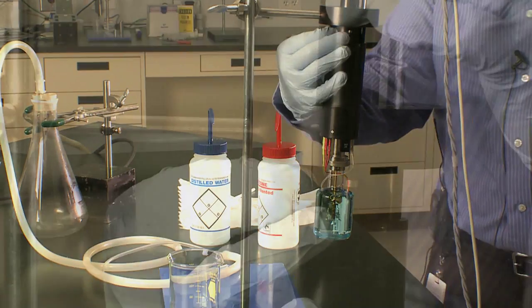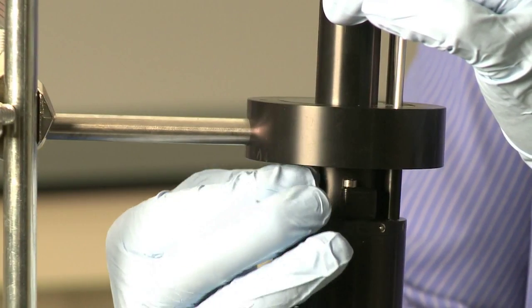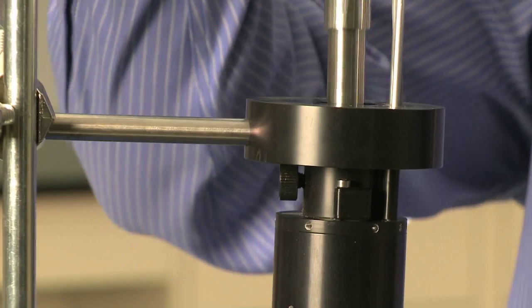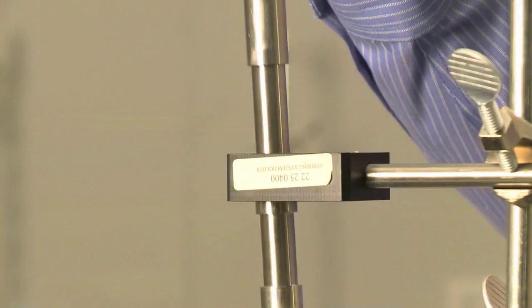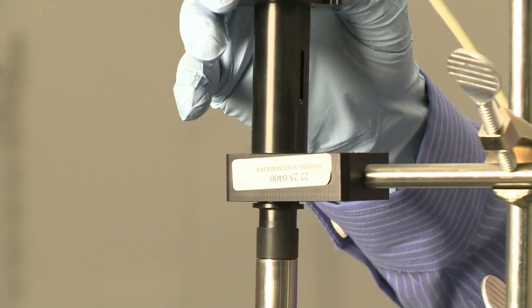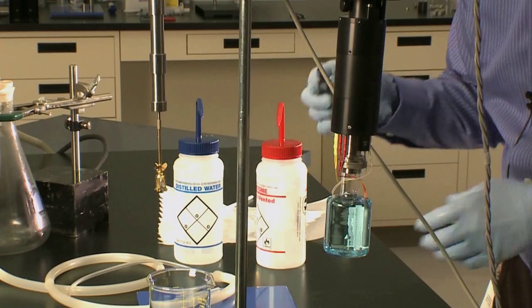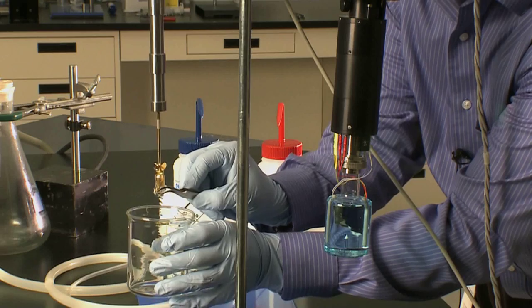First, remove the stirring mechanism by loosening the little lock screw and lifting it straight out of the solution calorimeter. Take it over to the ring stand holder. Then you can remove your glass ampoule from the experiment.